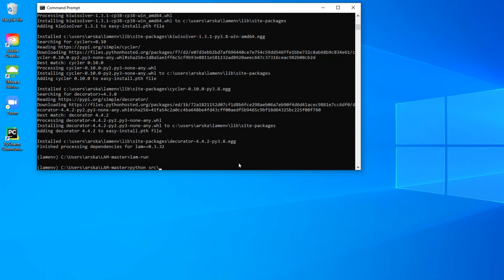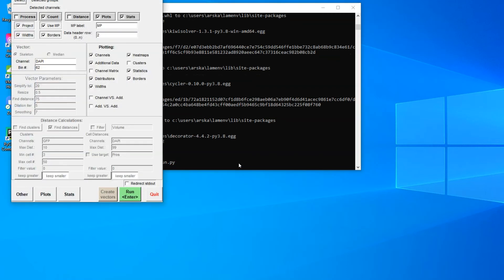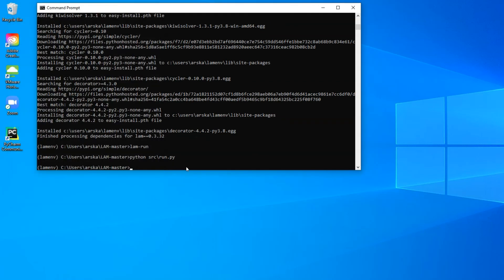Alternatively, you can use software like Spider or PyCharm to open the run.py file and execute it from there.